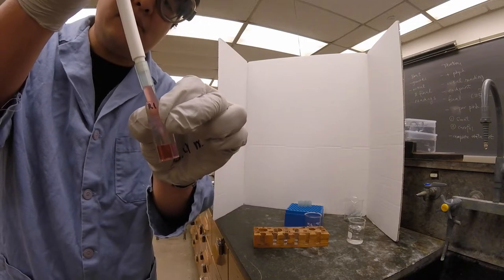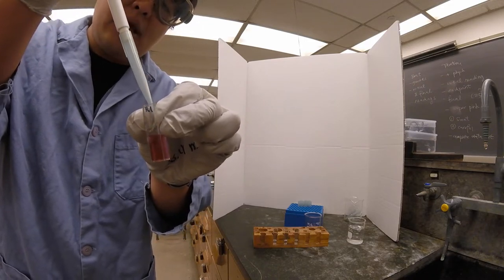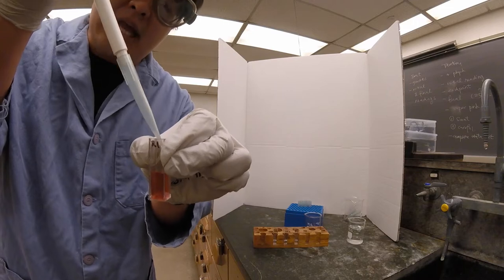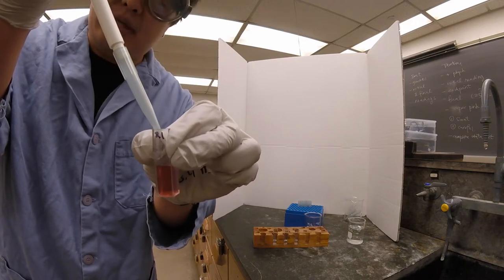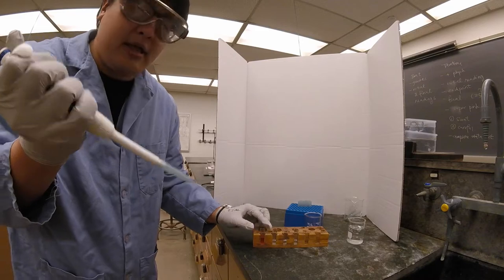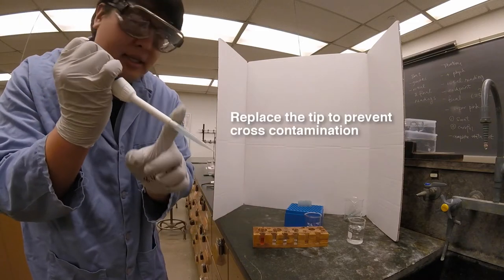So I'm just going to mix it several more times and then when I'm done, I'm going to press the second stop to make sure everything is out. I'm going to put this back in and then most importantly I'm going to eject this tip.